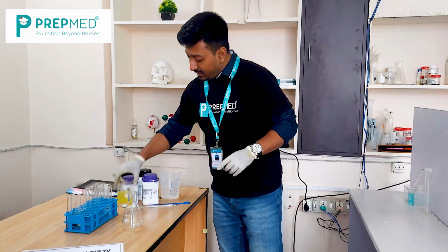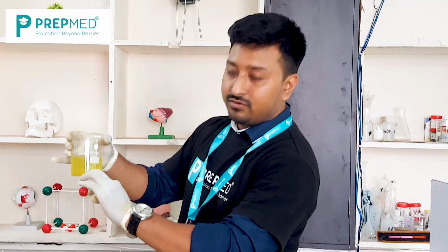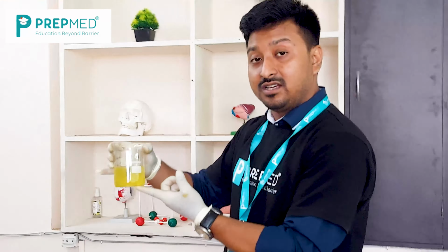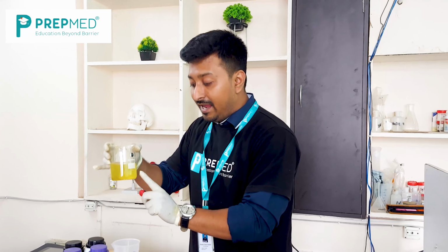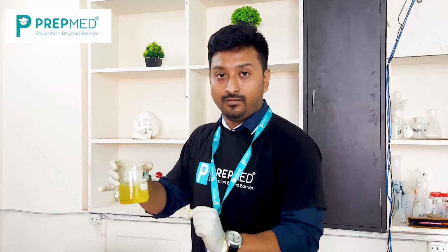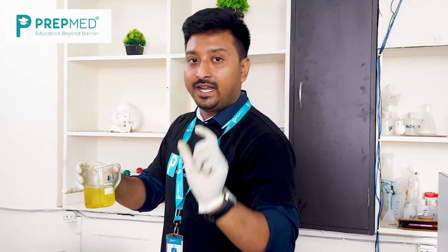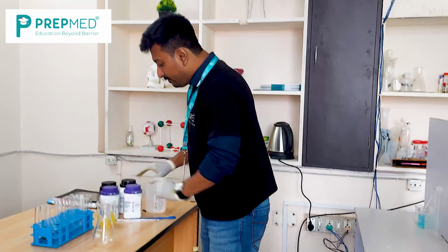Now we have already added sodium hydroxide solution and glucose here, and you can see, interestingly, the solution has turned yellow. Now in the comment box, I want all of you to comment why, when adding glucose in sodium hydroxide, the solution turned yellow. Definitely there is a reaction going on. In the comment section, write about that reaction. Okay, now see what I will do at the first step.